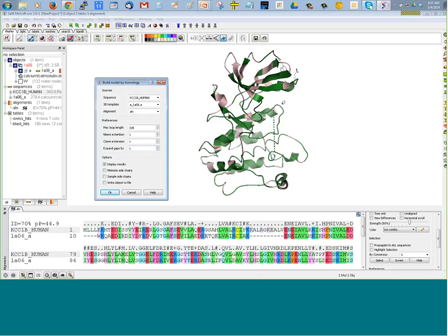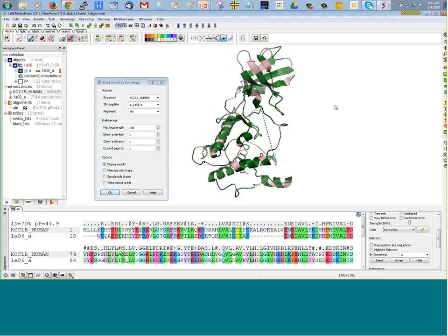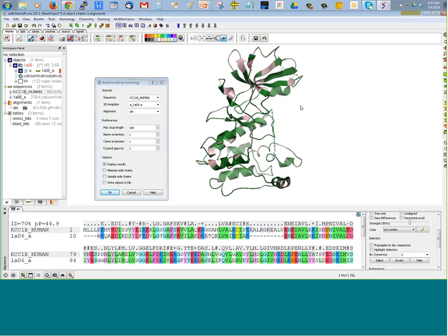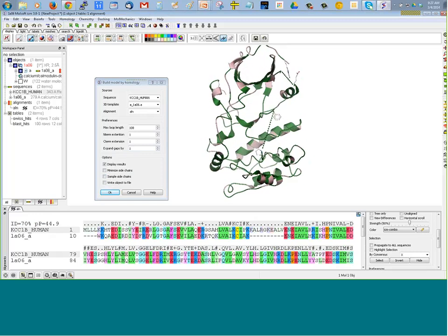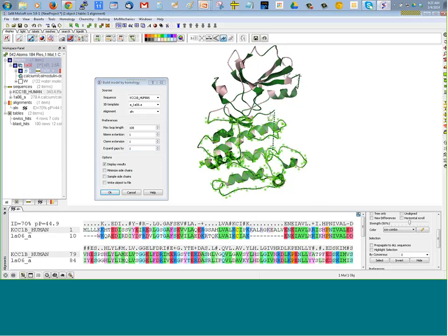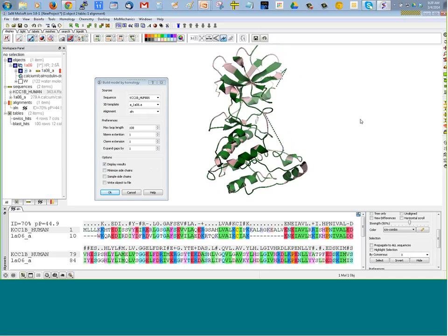This is a kinase, so if you're looking at the ATP binding site, or trying to model allosteric pockets in the N-terminal, you may not be interested in building loops and optimizing the C-terminal. So you have to be careful about what you waste your computing time on optimizing. In this example, we'll just build a raw model.